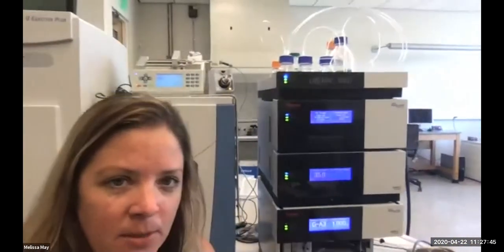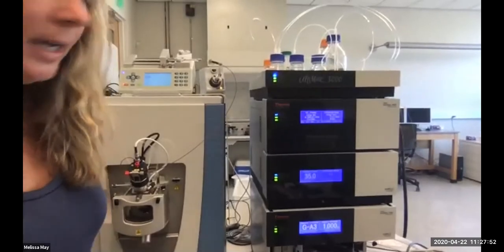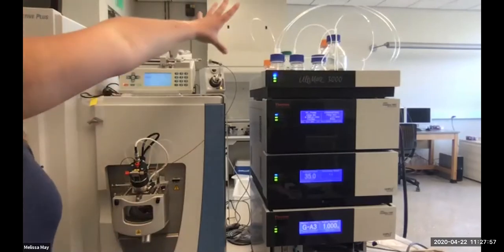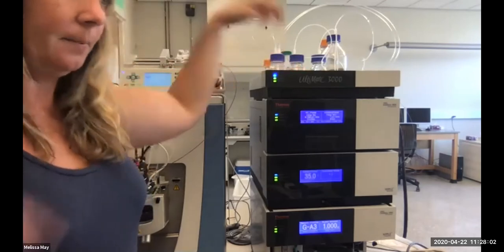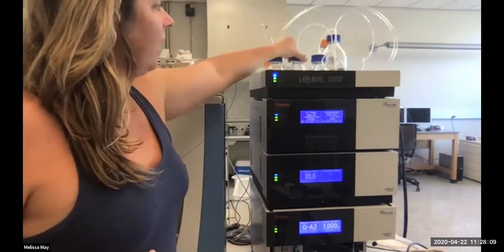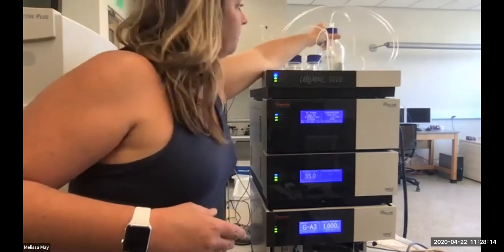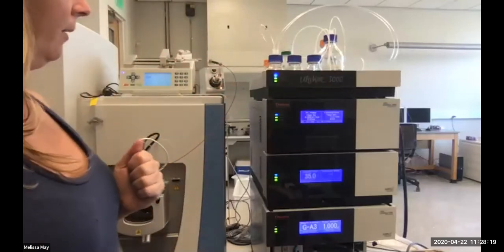Most of what I'm going to be talking about today is the LC component. I don't know how well you're going to be able to see things, but we have various different components of the LC. Up top, we have our rack holder, and this is where all of our solvent bottles are. We have our loading buffer, solvent A, solvent B, and our rear seal wash fluid. These are all solutions that I've talked about in previous videos.